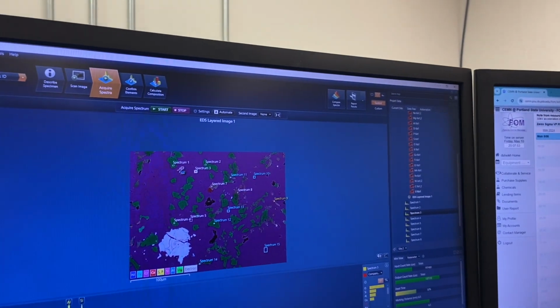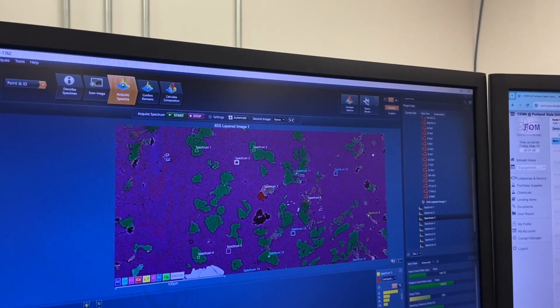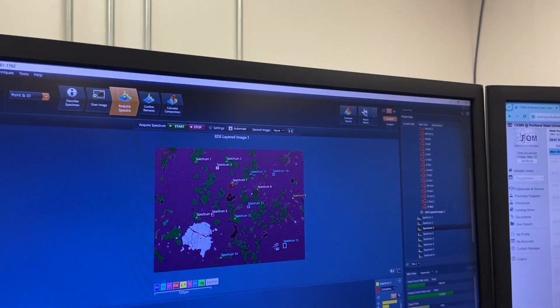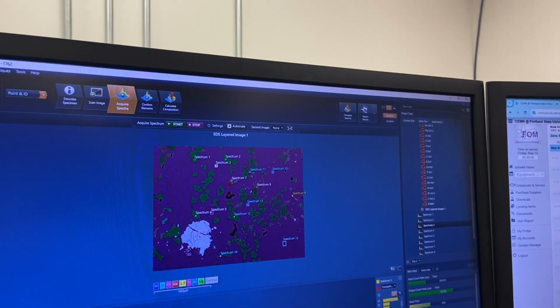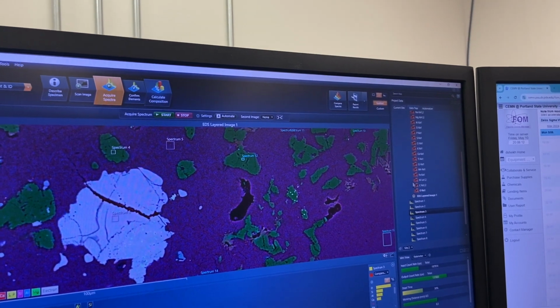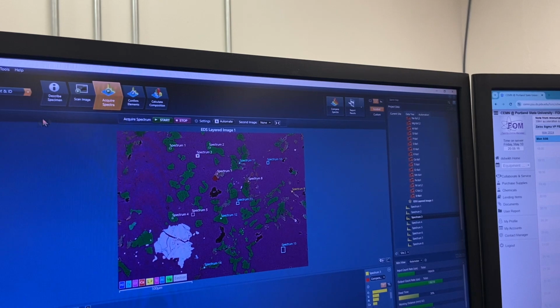I can tell by this feldspar that this is maskelynitized. This is amorphized. This is maskelynite, not crystalline feldspar. So this might be a crystalline melt breccia, as my guess has seen shock deformation, which is probably why we get troilite in here. I imagine we have metal. Maybe that's what this is right here. Let me see. I can check. I gotta be on maps here.